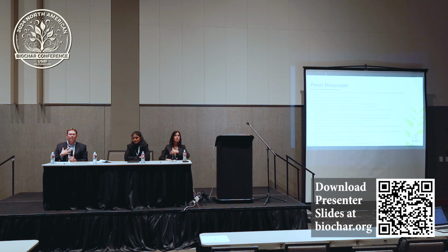and when a laboratory gets that, if I'm brave, I will say, okay, I'm going to give this a shot. And I'm going to come up with something that can deliver to these individual standards. And what I'm going to deliver you is a number. And then Lalitha is going to do the same thing. She's going to get that, and she's going to look into it and try and figure out her way of doing it and come up with her best interpretation. And then she's going to deliver a number. And although our labs might be reputable and even accredited, our numbers might not match, simply because of a difference in how we decided to put it together.